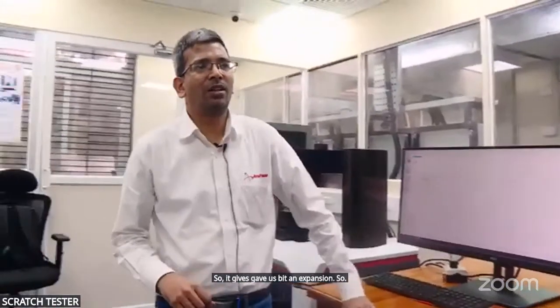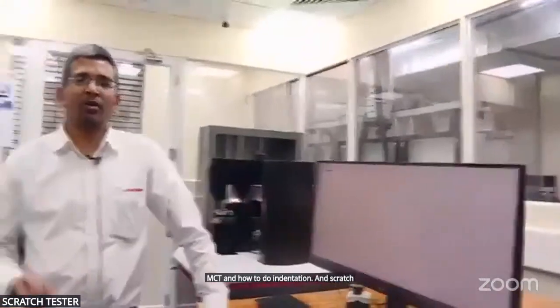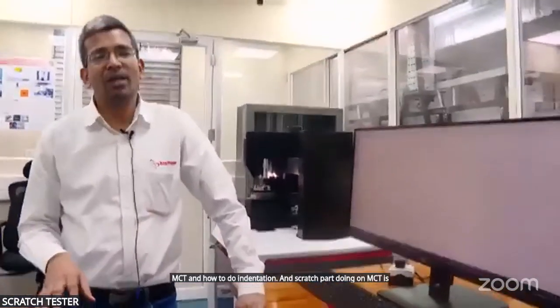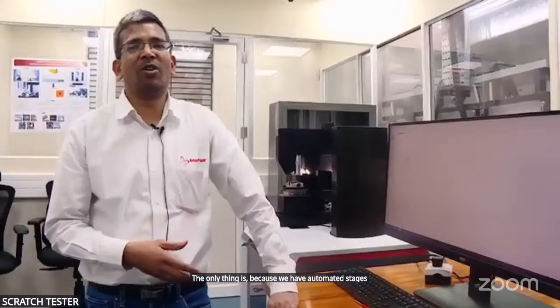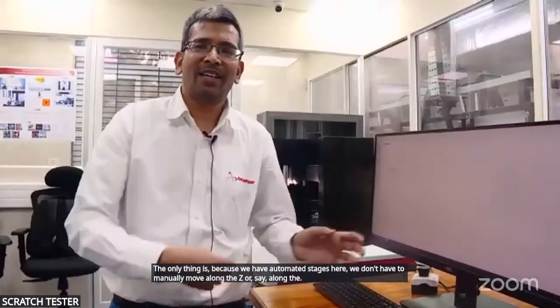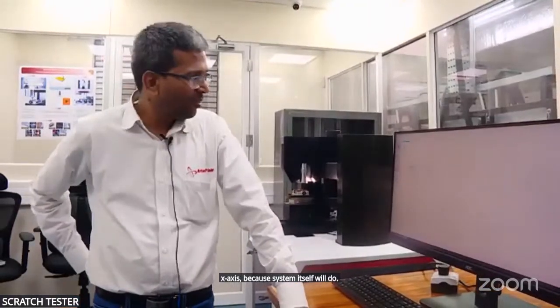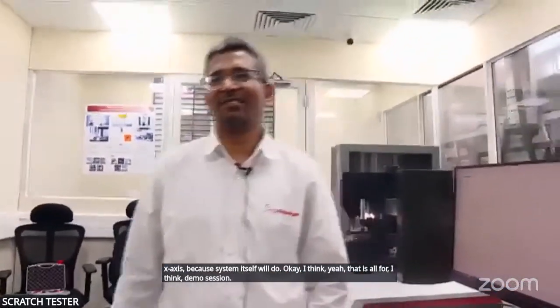So this is in general all about our MCT and how to do indentation. And the scratch part on MCT is entirely similar to what we did on RST. The only thing is, because we have automated stages here, we don't have to manually move along the Z or the X-axis, because the system itself will do it. That is all for the demonstration we have. Any questions you have, you can ask.